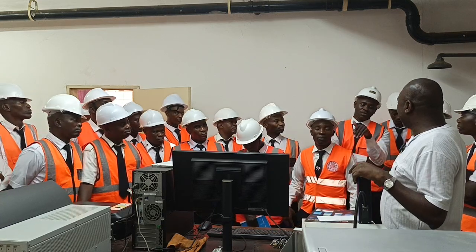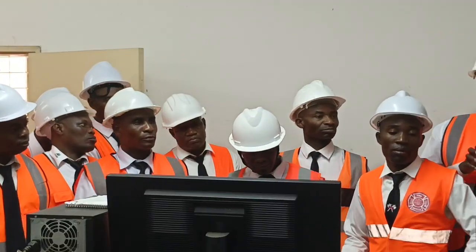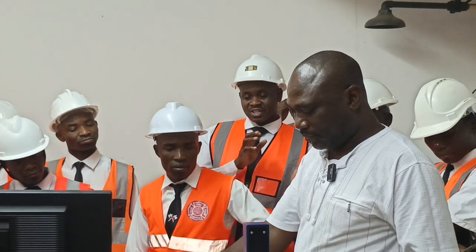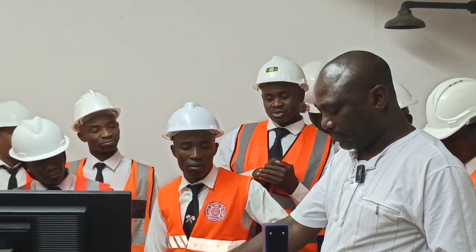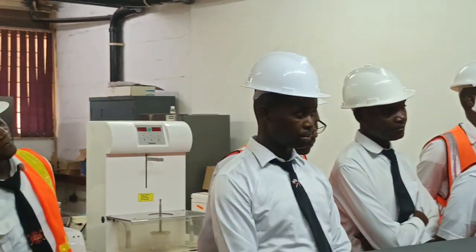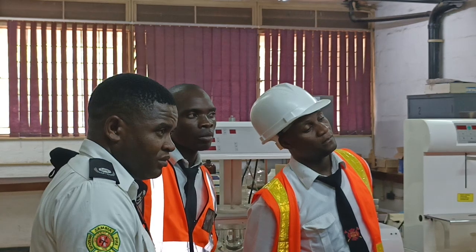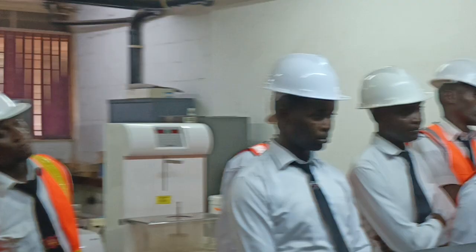Now, just on the machine. Considering the fact that you take the swab, when someone maybe opened the door, you don't know that person, and maybe has even traveled, has gone back to the copper plate. Then you do a DNA test. Are you able to say it's this person? Maybe it goes with when you get the samples from the same. Yeah, for DNA matching, the two people must be there.